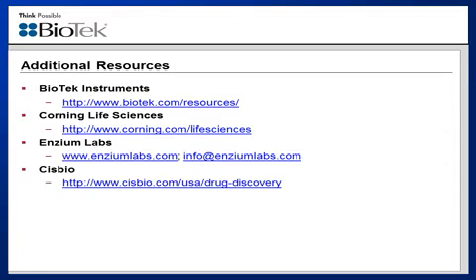The first one states, when the spheroid is first introduced into the well, do you centrifuge the plate, and at what time and duration did you take? So the answer is yes. It's important to remember that for centrifuging the microplates, the centrifuge should be cooled down.